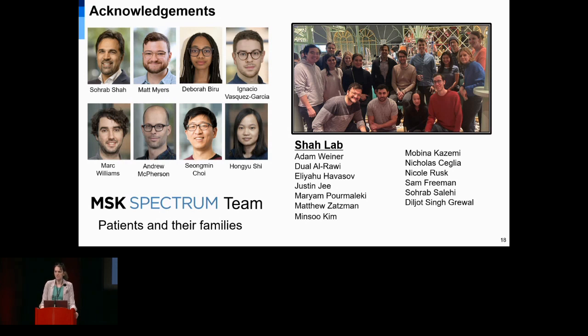Can I ask a quick second? Did you compare your results with the clonal, if you just do pseudo bulk per clone? And yeah, did you compare your results with the clonal events in this case? We did. We find that actually it does a bit worse because if we do pseudo bulk per clone, the coverage is much lower. So variant callers just call less, essentially, when we do that. Makes sense. Okay, thanks a lot.